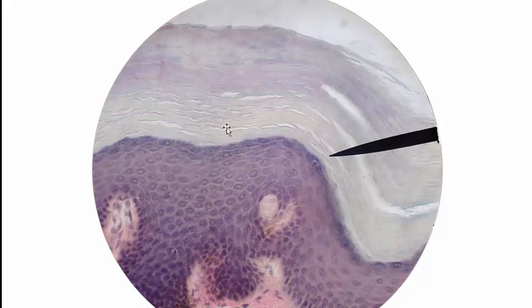During a lab exam, if this is what we were seeing, by the way, I would actually put the pointer up here to try and make it more obvious. But even down here, it's pretty obvious that that pointer ends inside of the stratum lucidum. And what receptor do we see here? The answer to that is a tactile corpuscle, or Meissner's corpuscle.